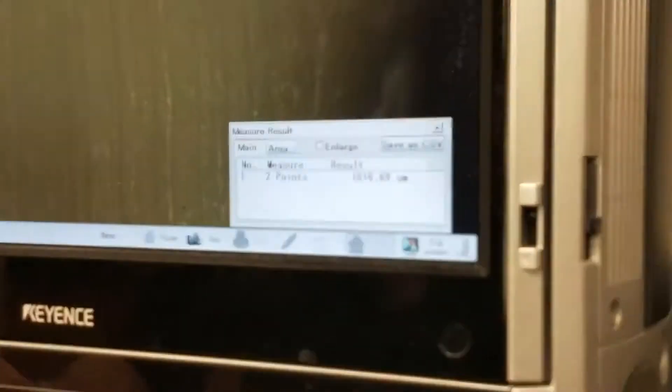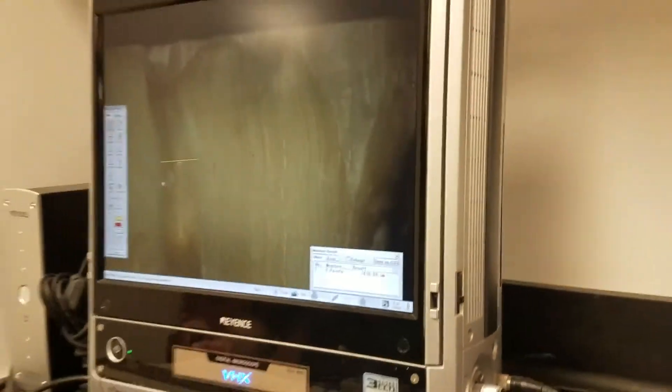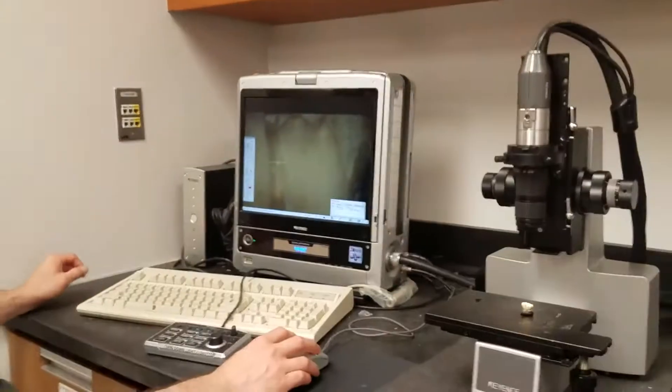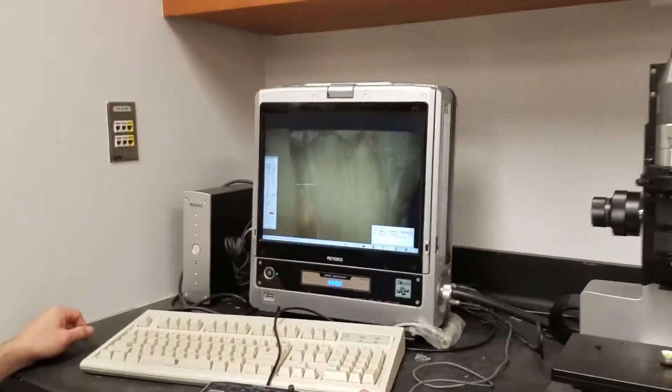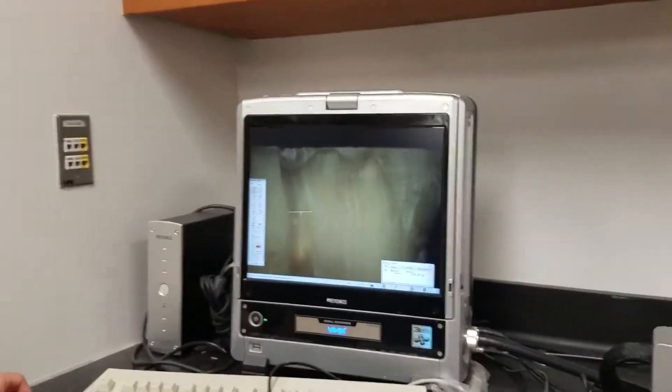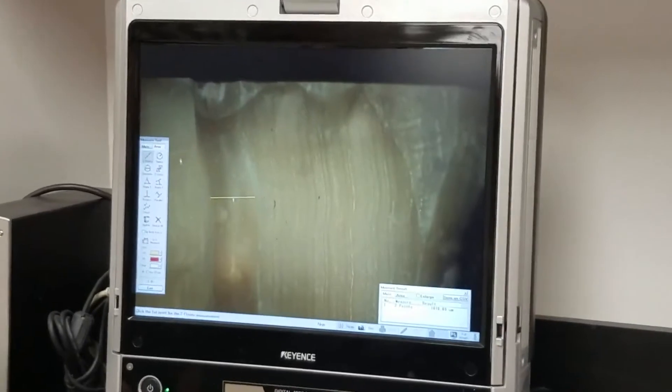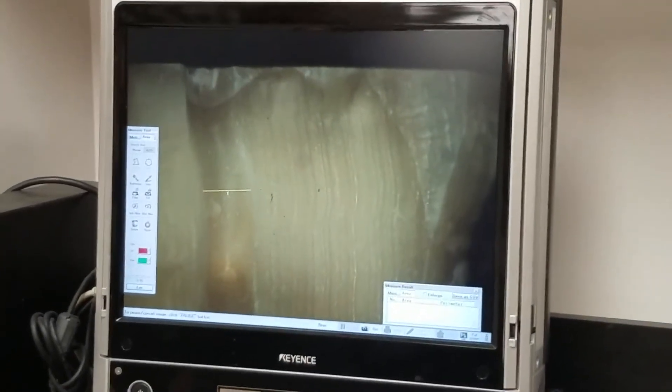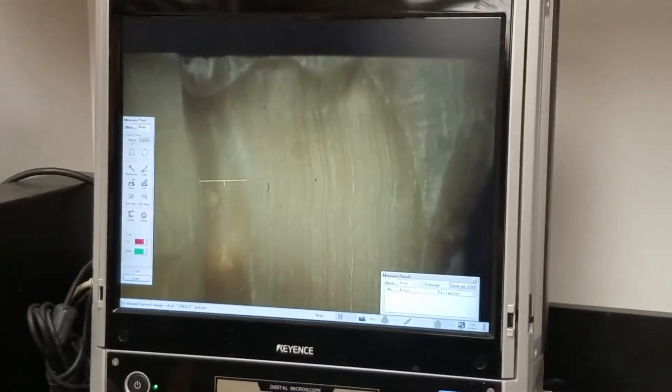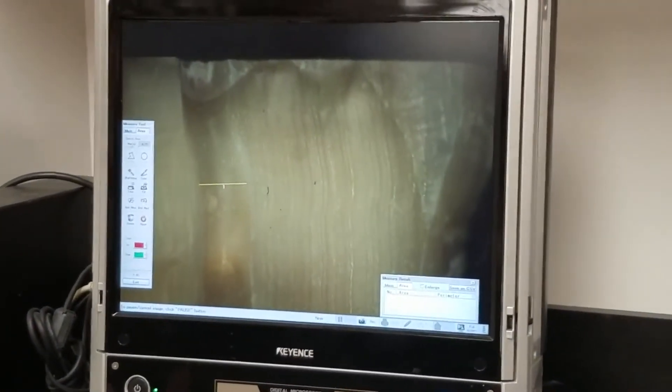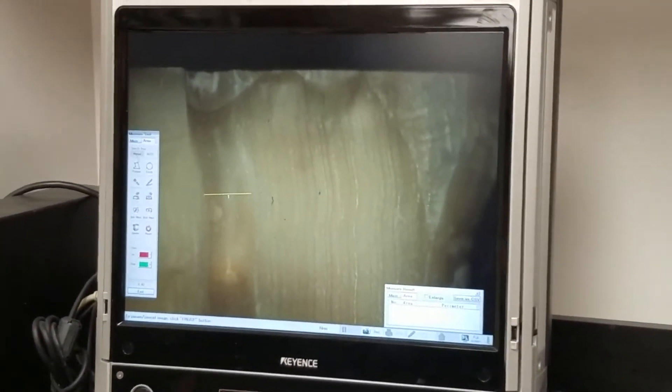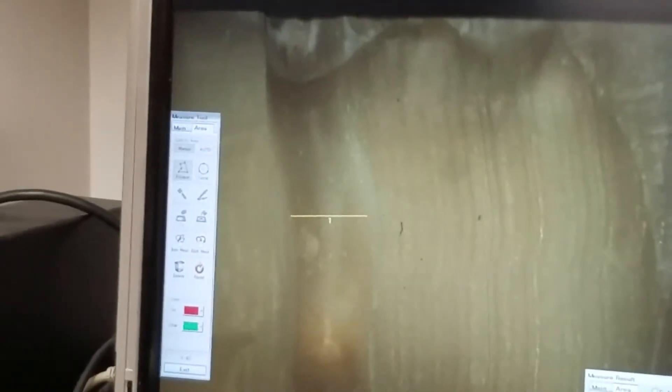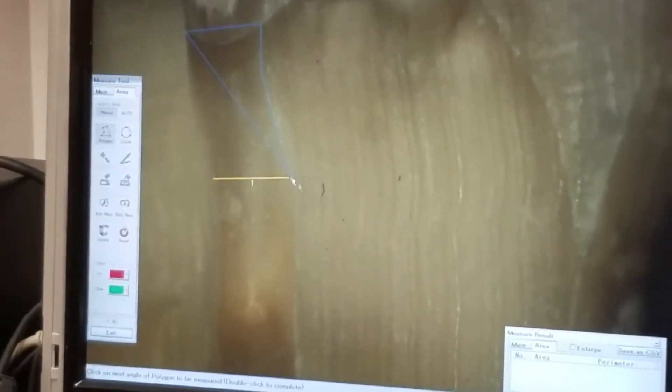And if you want to see the whole screen again, I can make other measurements out here, like I can make a measurement of an area. So I could go manual, I could do a polygon tool. And now I can measure the area of this cut if I wanted to.